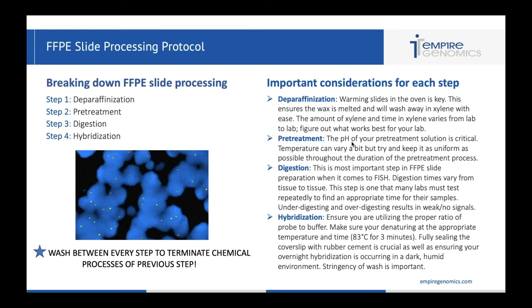Look at the stringency of your wash. If your stringency is too high, you can wash away signals, and if it's too low, you can just have a lot of background. Also, between every step you need to wash. I've seen a lot of protocols where people don't wash after deparaphanization, pre-treatment, or digestion — it's really important to wash between those steps because you need to terminate that chemical reaction of the previous step. If you remove something from digestion and don't wash that slide, the pepsin is going to continue to eat away at your cell and you're going to yield bad results.